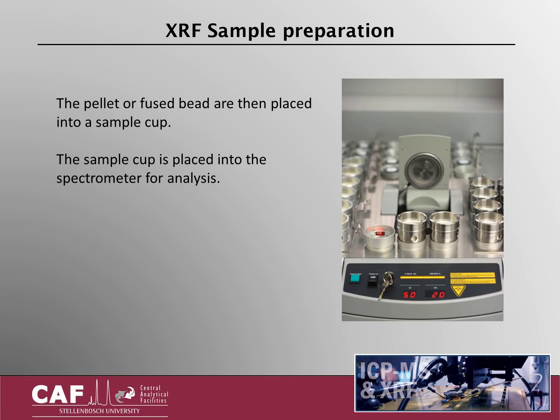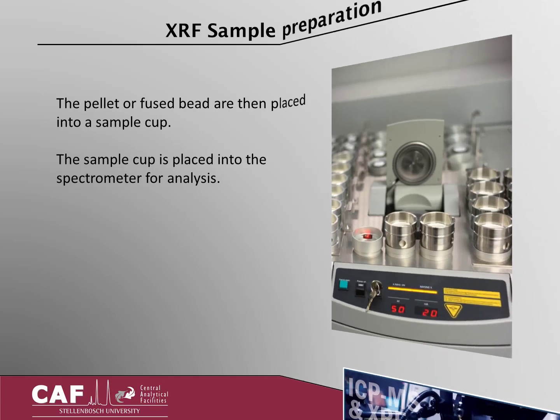After the preparation of either fused bead or pressed powder pellet, analysis can occur. The disc or pellet is placed inside the sample cup, which in return is placed into the XRF spectrometer for analysis. With correct storage conditions, fused beads and pressed powder pellets can be used multiple times. It is thus a non-destructive technique.